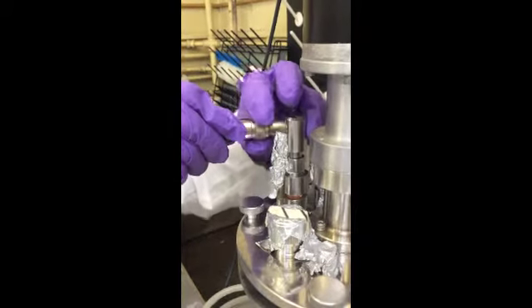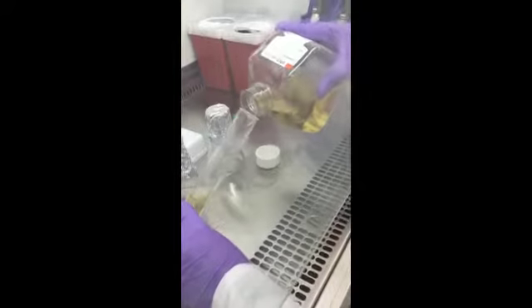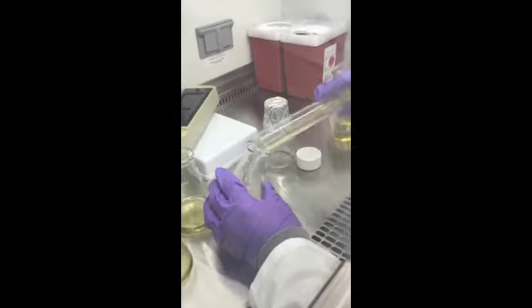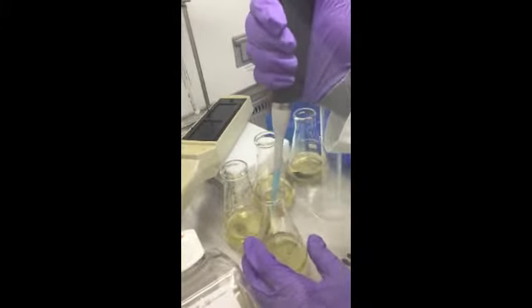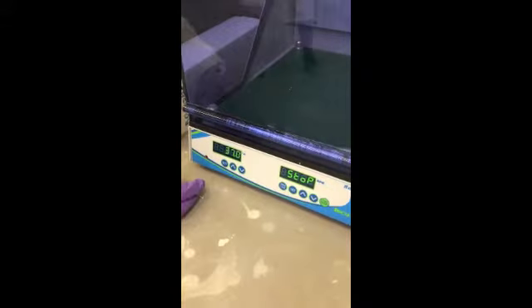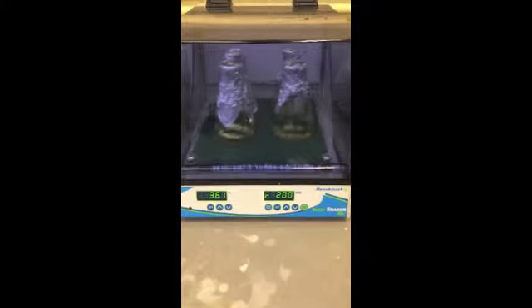Before sample preparation, make sure all flasks are properly labeled. 60 milliliters of LB media and 0.5 milliliters of E. coli were put into each of the 4 flasks. The benchtop shaker was set to 37 degrees Celsius and 200 RPM and left for 15 hours to inoculate.